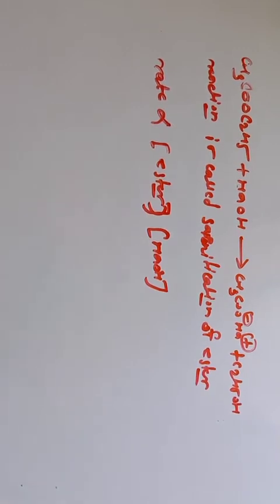So let us discuss the practical parameters regarding this reaction. It is a second order reaction, and with the help of conductometry we can easily measure its rate constant.